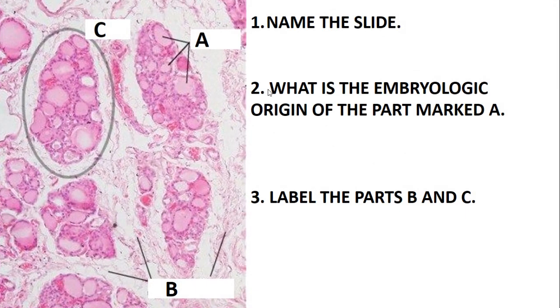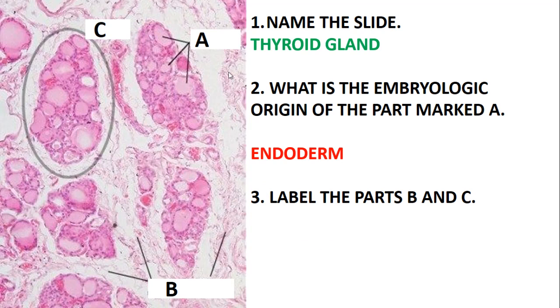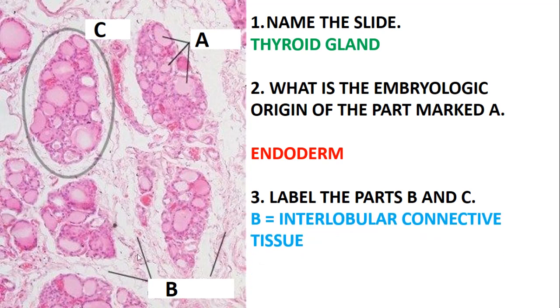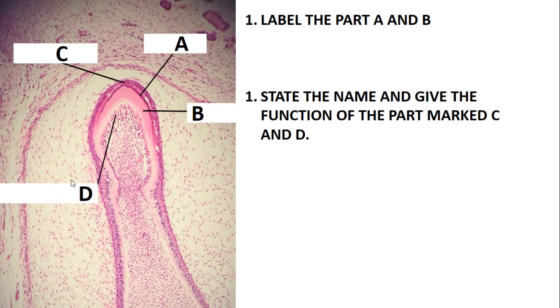Name the slide. This is the same slide where we looked at the parathyroid and thyroid, but now focused on the thyroid gland. You can see some lobules — the whole structure is the lobule — and there are follicles as well, so this is the thyroid. The embryonic origin of the follicles marked A is the endoderm. Part B is the interlobular connective tissue, and C is the lobe. A is the follicles.